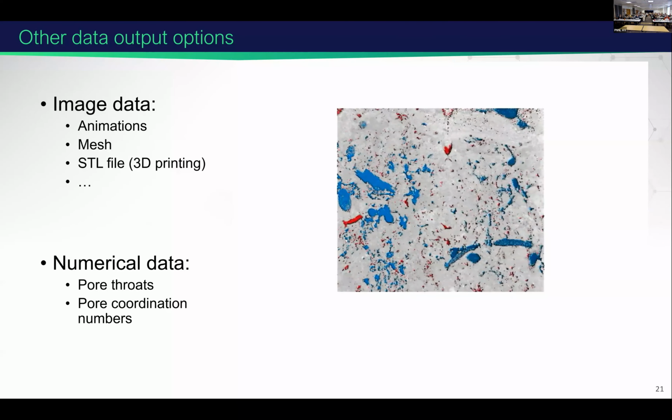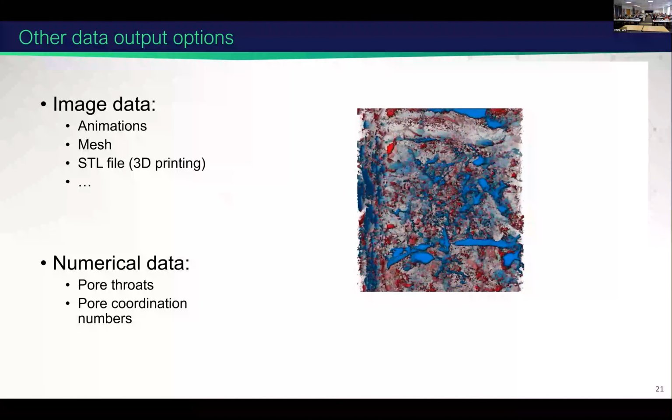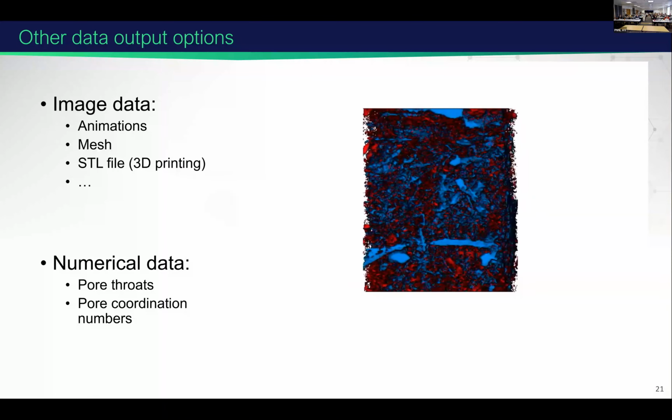As I mentioned, visualization will also create some animations. This is one of the animations that we created in the software. Thank you, Arnav.